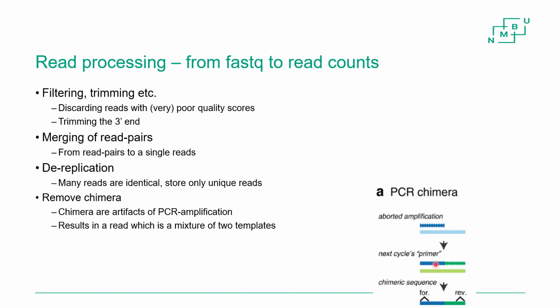Like a primer. And now, let's say this, so you can see this is a copy of this blue organism here. But this part of the blue organism also is the same as this part of the green organism. So this blue short sequence from up here is now used as a primer for starting to amplify the rest of this organism.